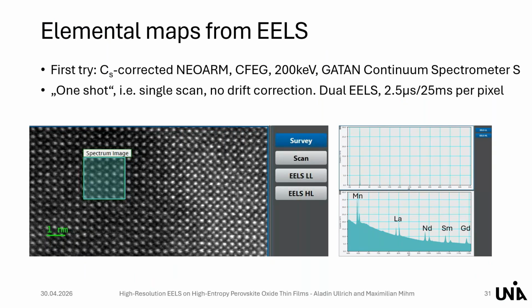The next question is about the time result, or maybe before I go there, I have another question that someone is asking. You did talk about the sample preparation, but someone is wondering how to prepare such a thin TEM sample.